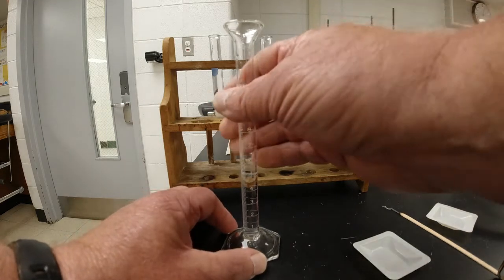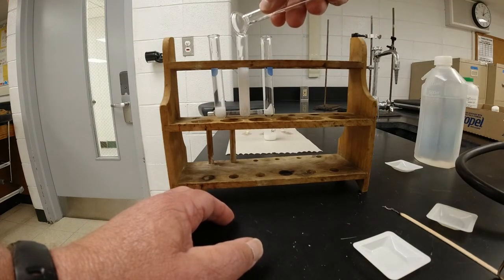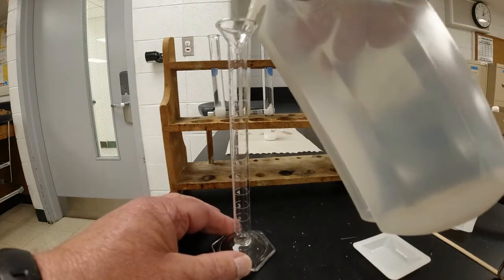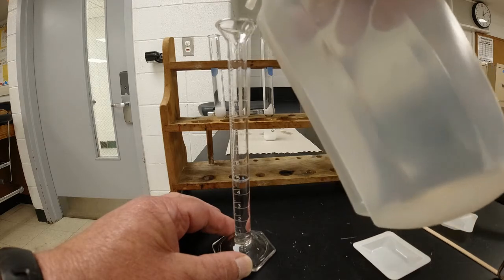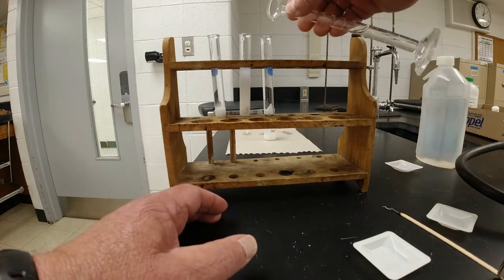Okay, that's about 5 milliliters of water. And that's about 5 milliliters of water.